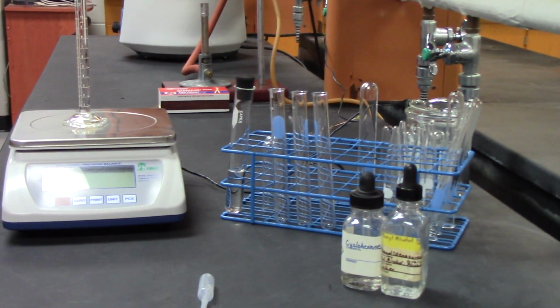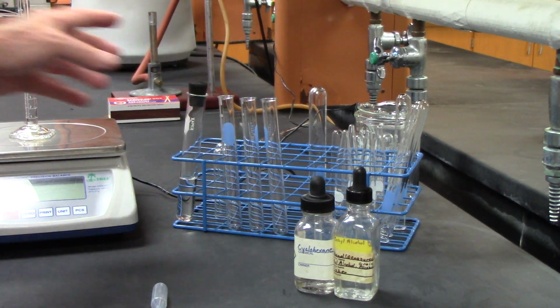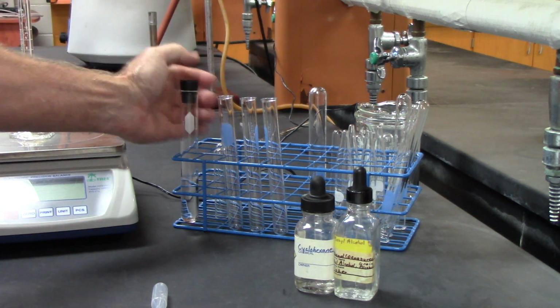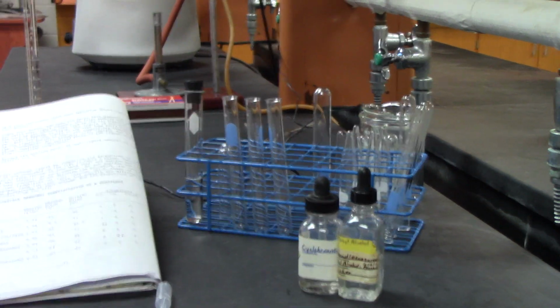Okay, so what I'm going to do is concentrate over here. I'm going to take my unknown, which is right here, and it could be a possible 5 or 6 different things. Those things are in your lab book. This could be acetone, cyclohexane, 1,2-dichloroethane, ethyl acetate, isopropyl alcohol, methanol, and methylene chloride. So on page 21, you'll see a list. And I'll show you that list right now, just so you can see what I'm talking about.